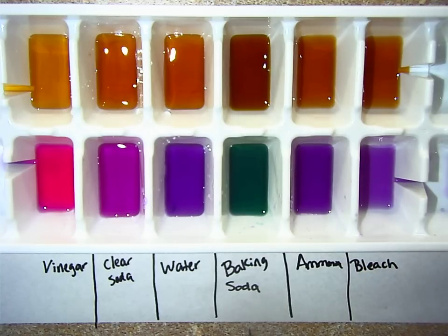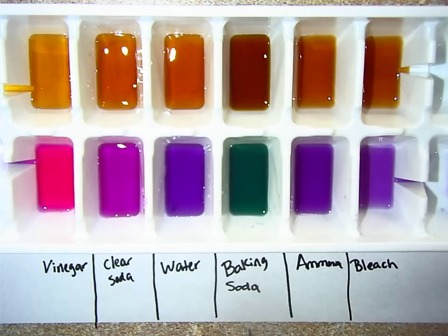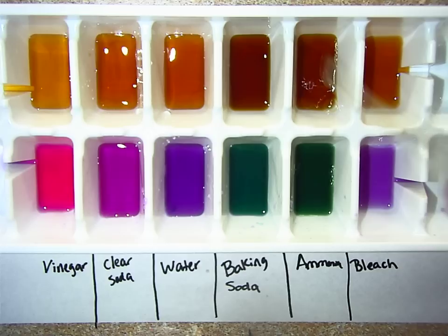Now let's go ahead and test ammonia. Ammonia is a pretty strong base, so I had to dilute it with some water so we can get an accurate color change for our lab. Ammonia changes red cabbage juice also a dark blue color. And then we put ammonia inside of black tea — look how dark it turns.